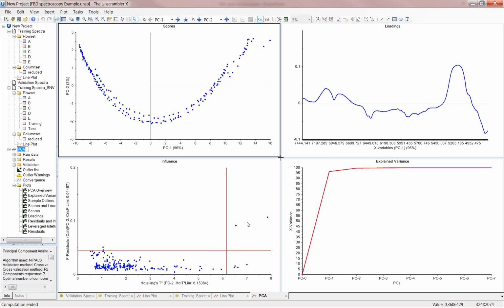So again, that's going to depend on the type of pretreatment you do. Something like a derivative, I tend to do across the entire range because it's not affected by what the range is. Something like an SNV looks at the range itself and calculates the mean and the standard deviation in that range. So if you do an SNV over a smaller range versus a different range, then you're going to get different output. So it really depends on your situation and which type of pre-processing you're doing.